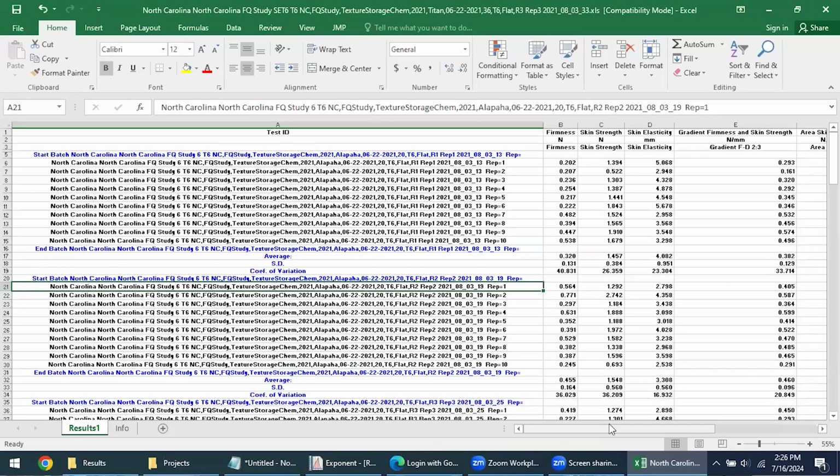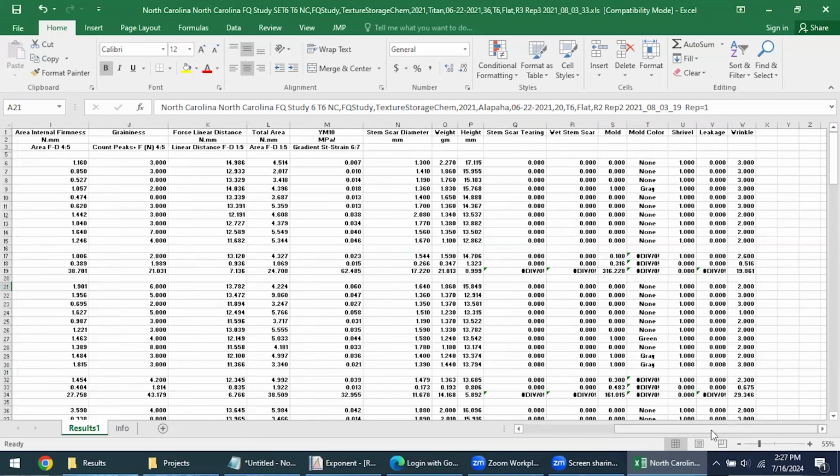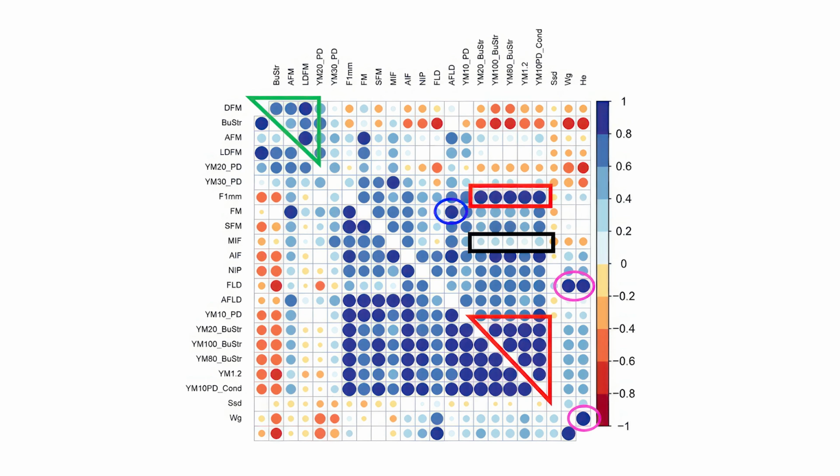The first column of the Excel sheet will have the information of the sample that you put in, like the sample name, the cultivar name, the harvest date, or the experiment name. And the following columns will have the data for each of the parameters that you set up for the macro. And this includes the data that was put in from the devices that you added on, like the digital caliper or the scale.